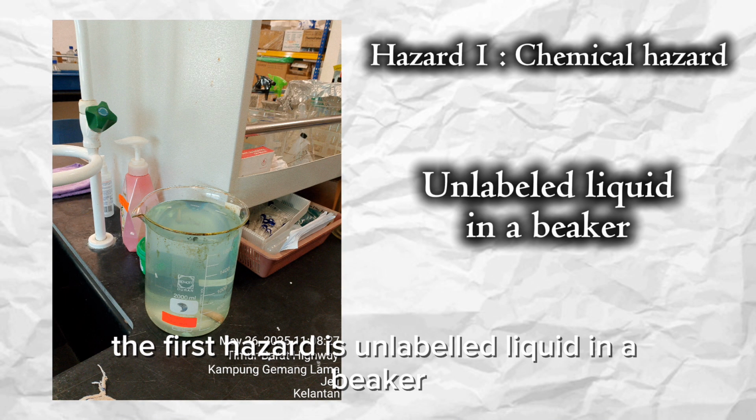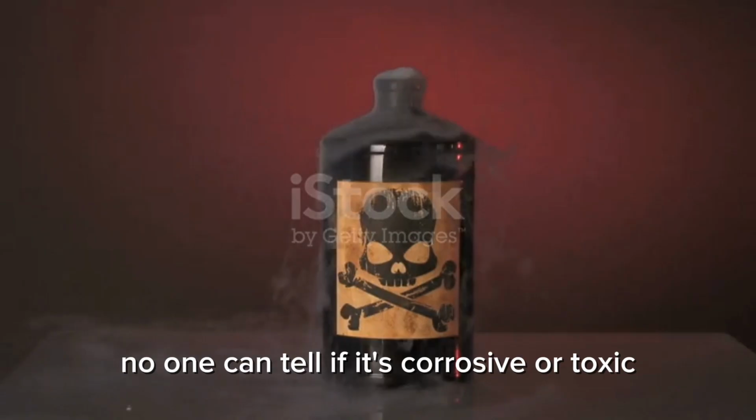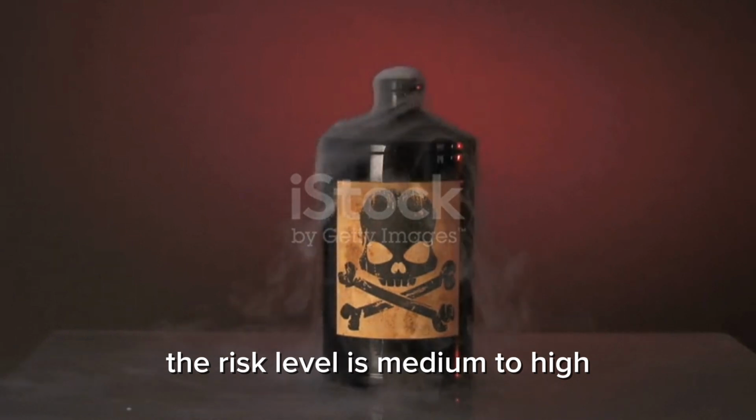The first hazard is unlabeled liquid in a beaker. This poses a chemical hazard because without a label, no one can tell if it's corrosive or toxic. The risk level is medium to high.